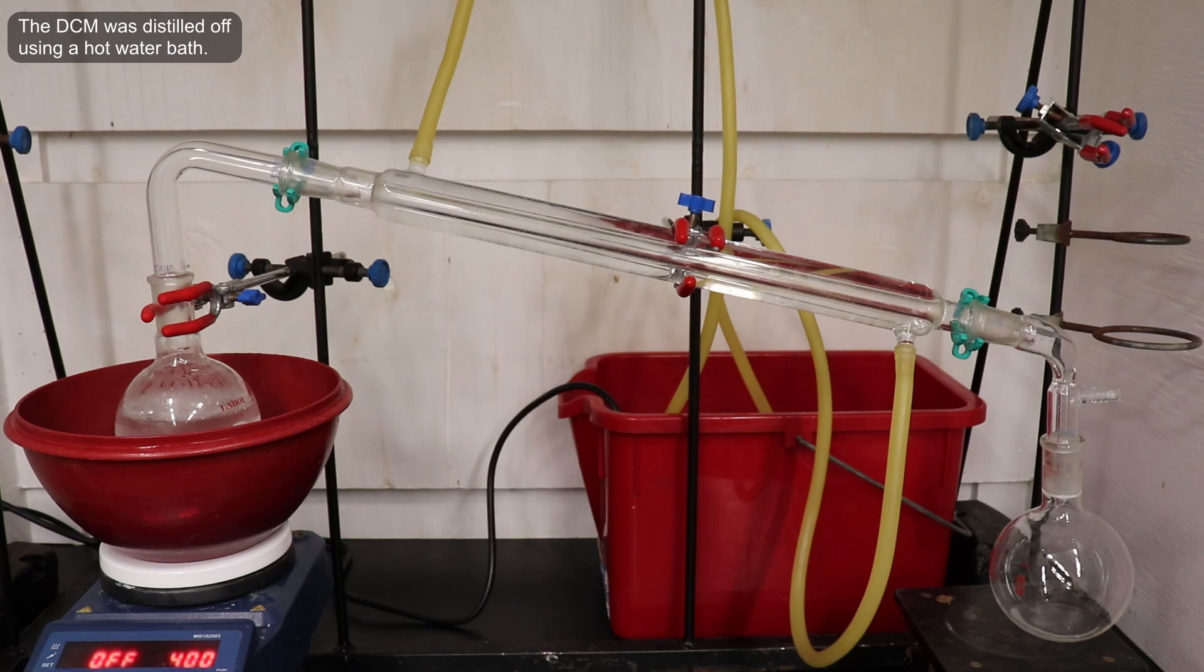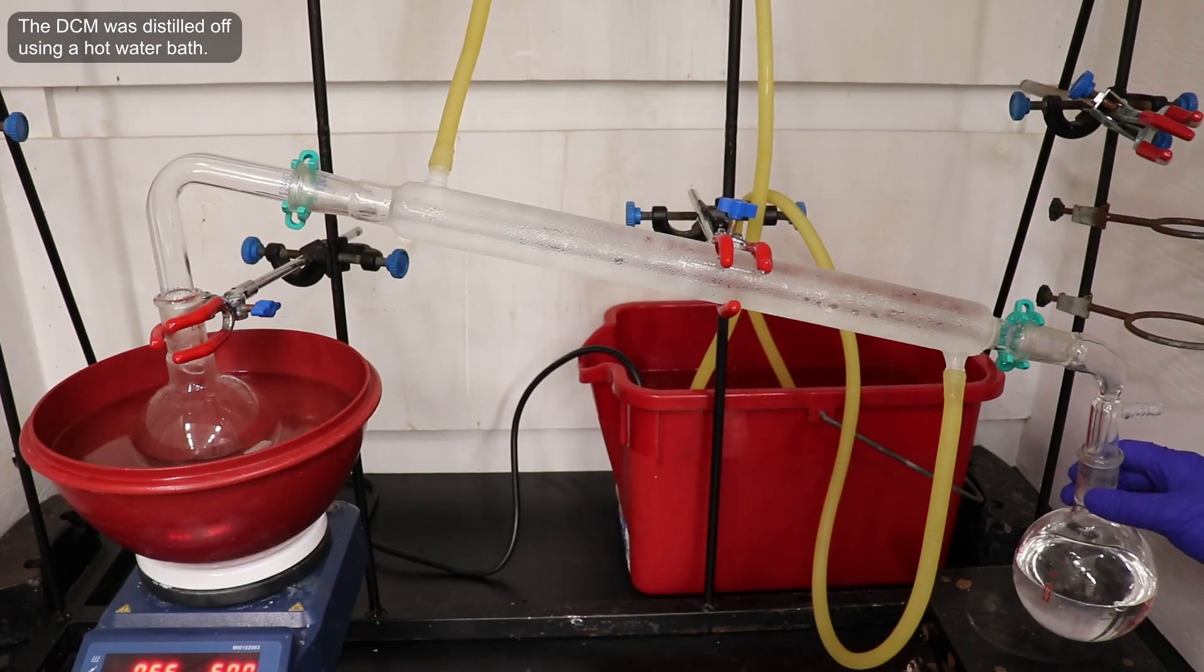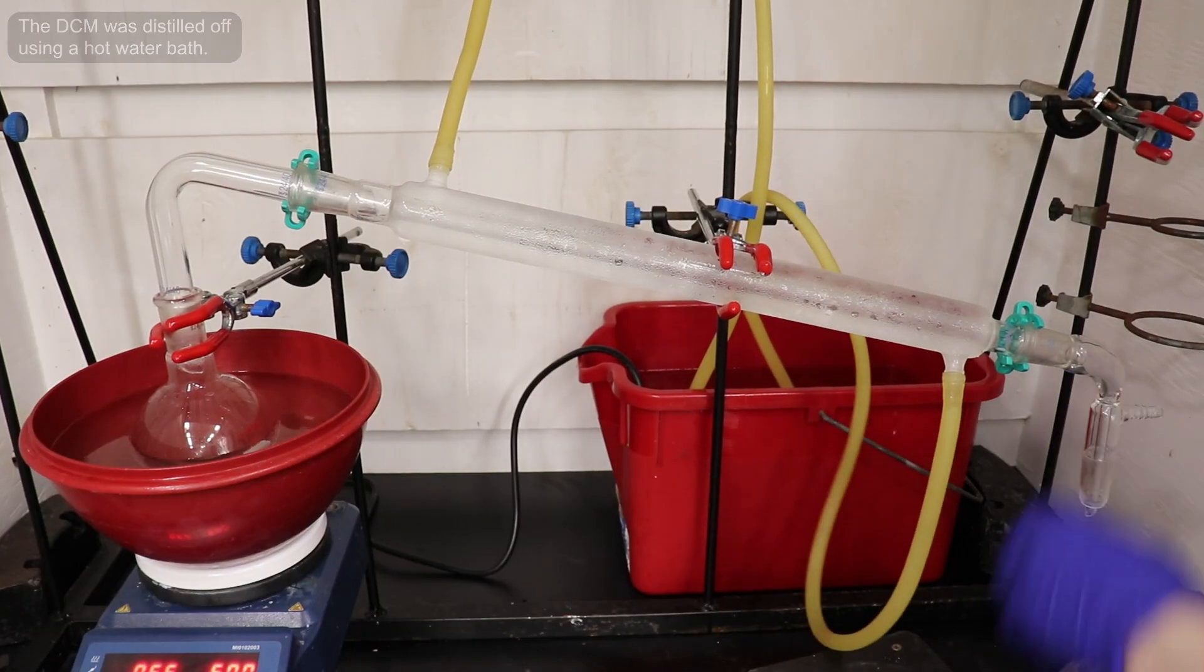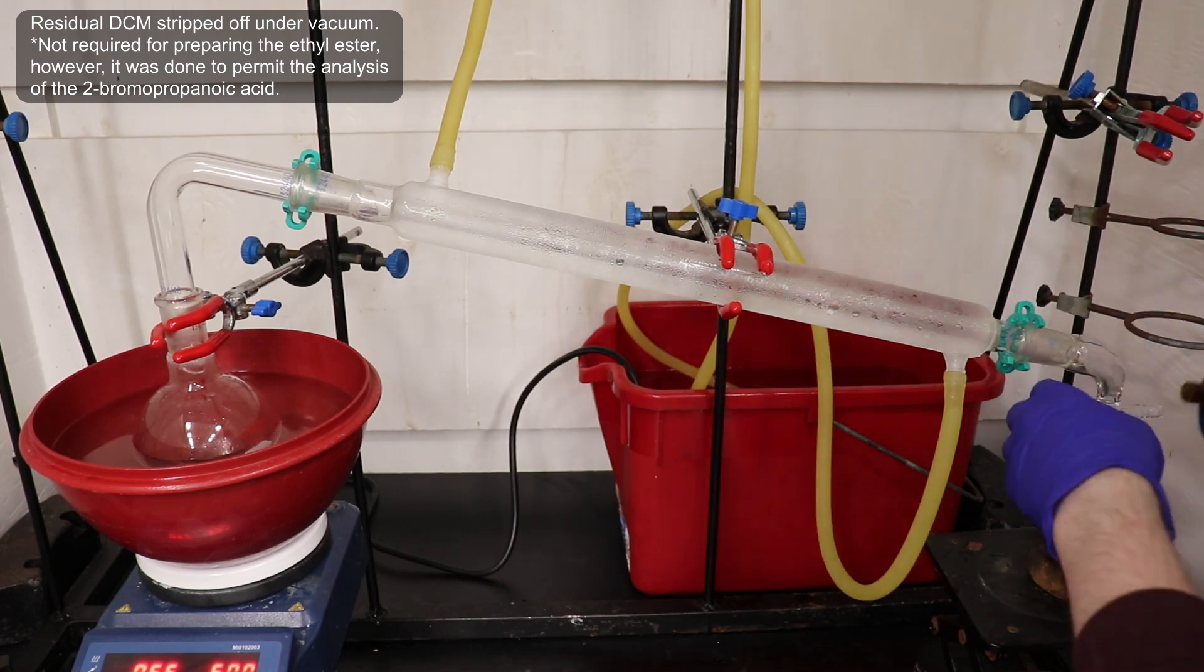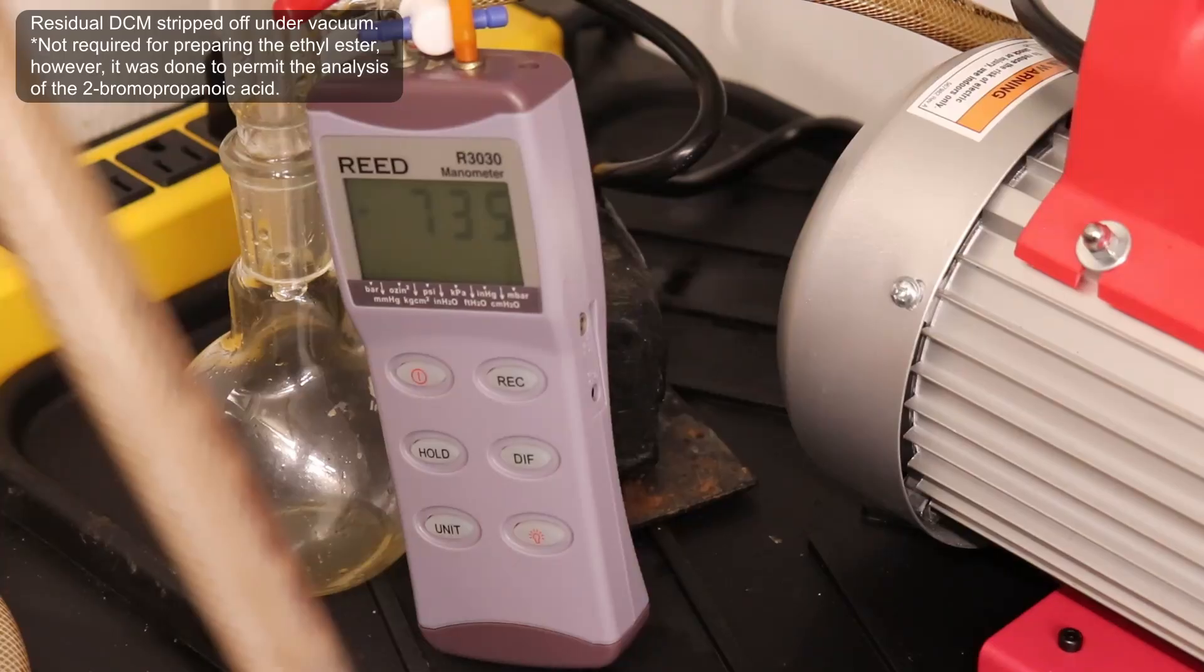I then set up for a simple distillation, and distilled off the bulk of the DCM using a hot water bath. Once the DCM stopped distilling over at atmospheric pressure, I emptied out the receiving flask, and then put the whole apparatus under high vacuum to pull out any residual DCM.